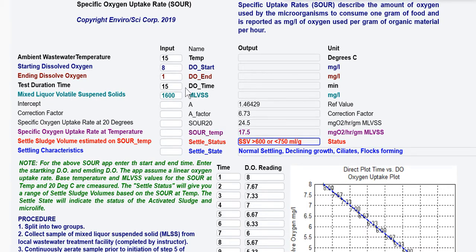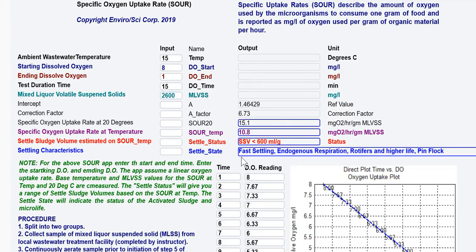If we change this value to 2600 and solve it, the values change. With higher mixed liquor solids, based on the specific oxygen uptake rate, we now have fast-settling sludge, endogenous respiration, rotifers and higher life forms, and pinpoint floc.